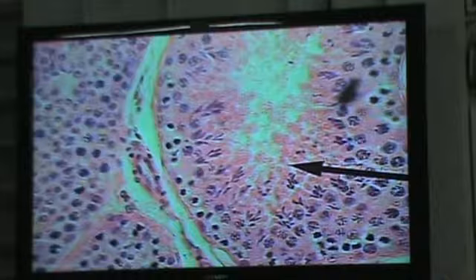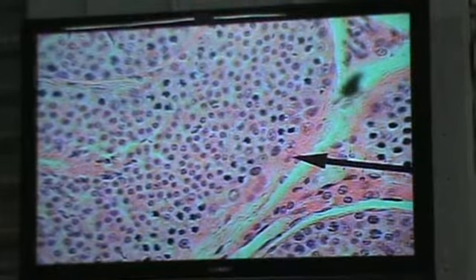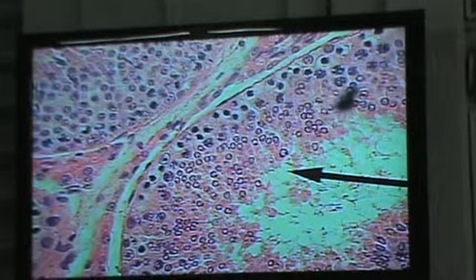There's a wave occurring along. So at different parts along the tubule, we find various levels of maturation. So maybe at one level towards the end, rather than a lot of spermatids, you'll see what? Spermatozoa. Okay? So you can start to see there's a lot of cytoplasm being shed, and there are some tails being formed. You see that? So there we see lots of little tails being formed right here. So this is a little further along.